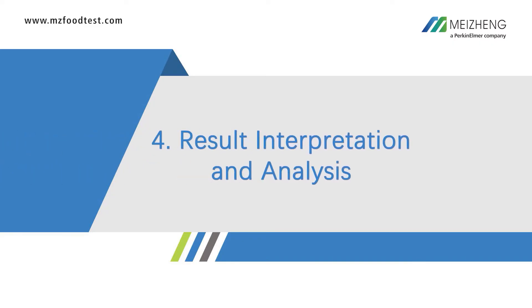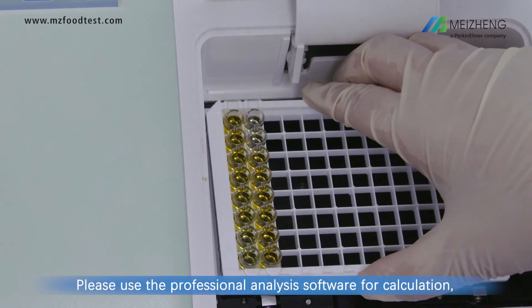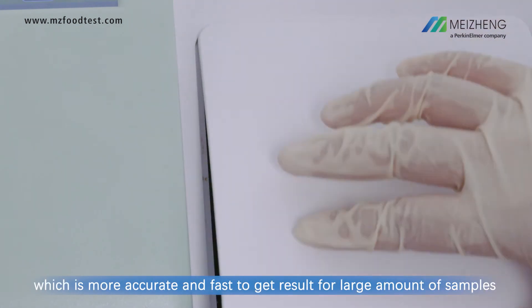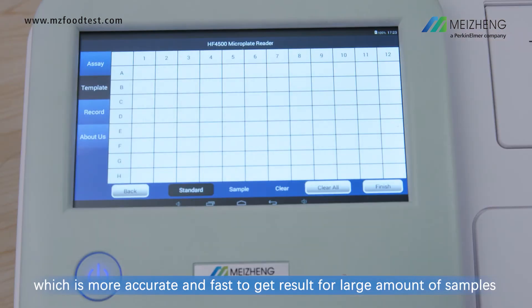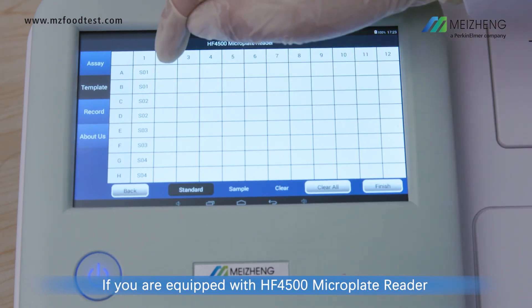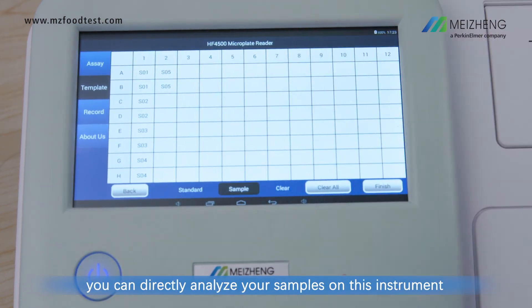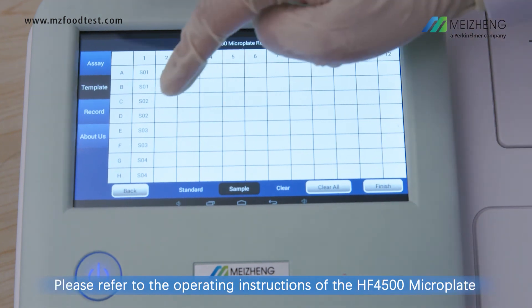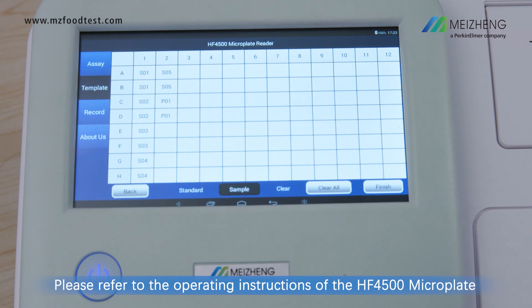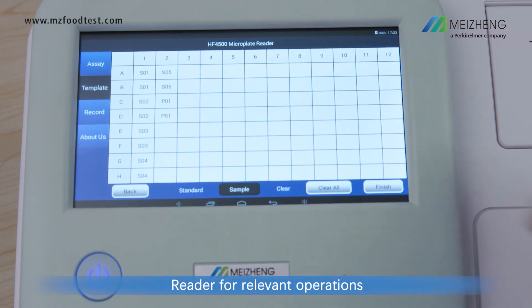4. Result interpretation and analysis. Please use the professional analysis software for calculation, which is more accurate and fast for processing large amounts of samples. If you are equipped with the HF4500 microplate reader, you can directly analyze your samples on this instrument. Please refer to the operating instructions of the HF4500 microplate reader for relevant operations.